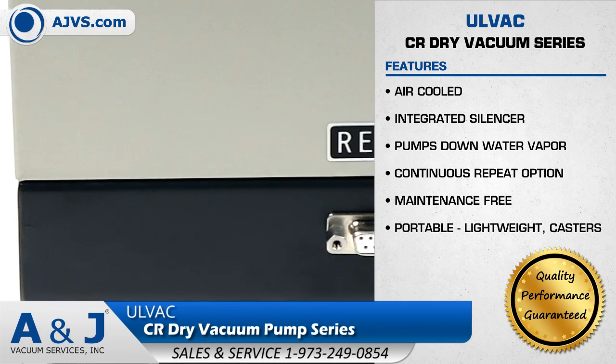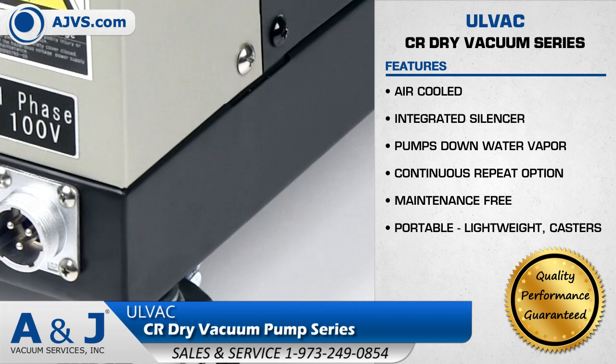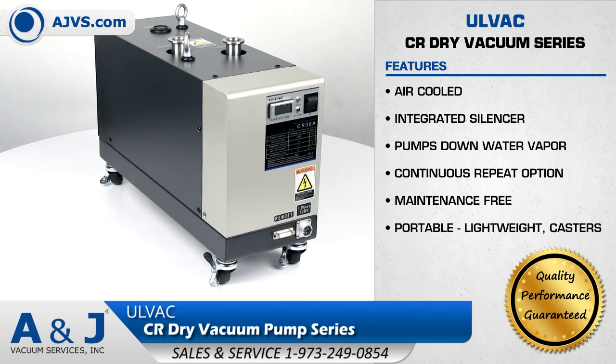It is maintenance-free and long-term continuous operation is possible, as there are no sliding parts. The Olvac CR is a lightweight and compact system, and the addition of casters makes it truly portable.